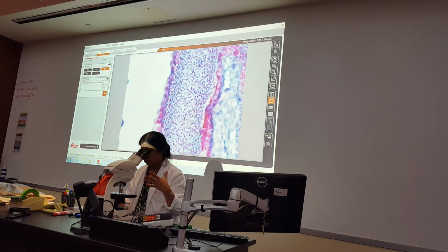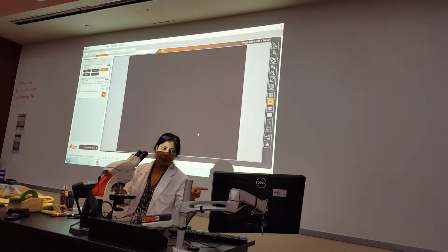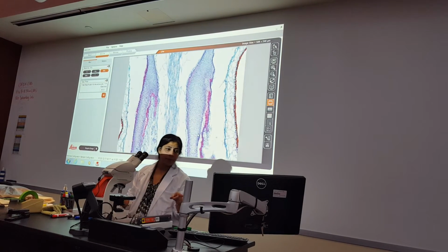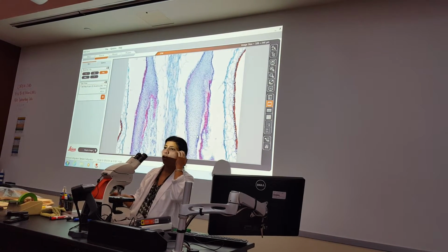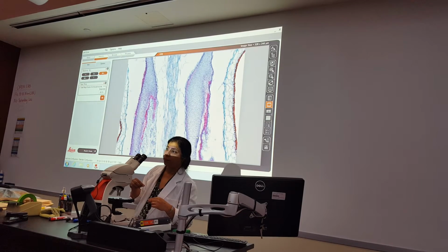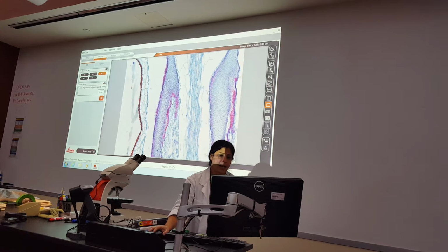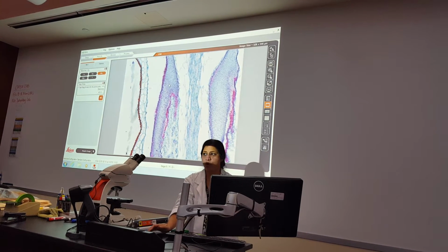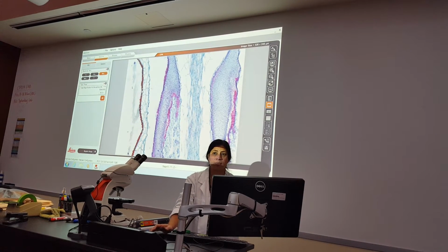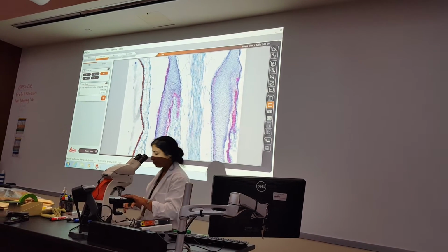You see, those are the spores. I will not focus it this way. In the lab practical, you will see it at this magnification. So this is how you will see it in the lab. You're not looking at the entire capsule, you're looking at part of the capsule. So are we good? I could point at any part of that and you just say capsule, except for the inside. If the pointer is here and I ask you what structures you're looking at, you will say spores. If I point outside like this and ask you what the structure is, you will say it's a capsule. If I point here and say haploid or diploid, what will you say? Haploid. And that's the moss, right?